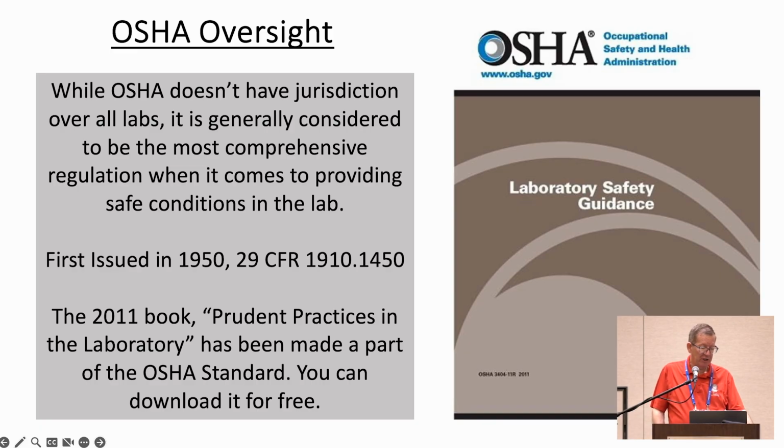It does reference the 2011 book from the National Research Council, Prudent Practices in the Laboratory. That is available for free to download. So I wouldn't even look at the OSHA standard. It has nothing to tell you. I would read the download. There's a lot of good stuff there. It does say that containment testing of the fume hood is more important than face velocity testing.